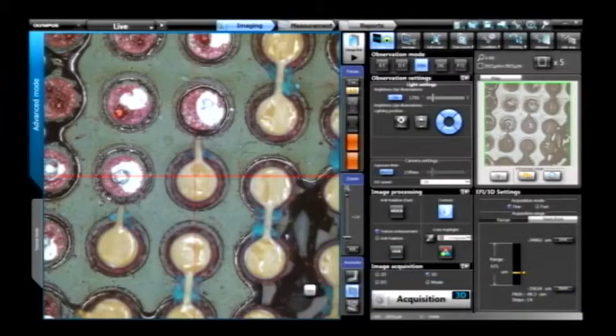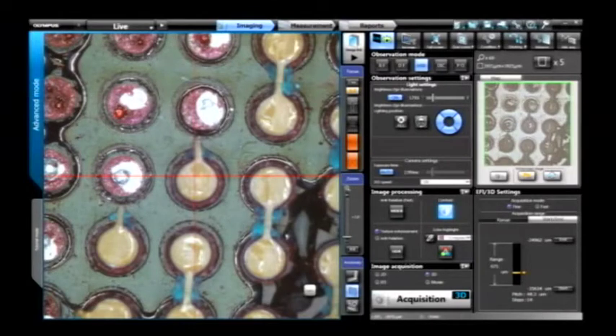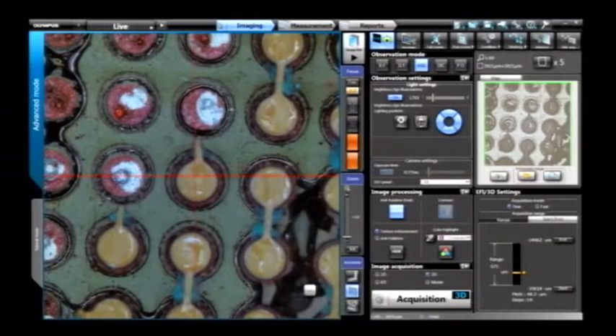Our built-in image processing features include an auto-contrast tool — a single push button to gain contrast on the surface of your image. We also have built-in HDR imaging to add contrast and adjust exposure: dark areas become brighter and highly reflective areas dim down. The downside of HDR is it doesn't have the fastest refresh rate. Olympus designed a new technique called WDR — Wide Dynamic Range — which reduces glare and brings up intensity in dark areas while maintaining a very fast refresh rate for screen movement, though with slightly less surface enhancement than HDR.